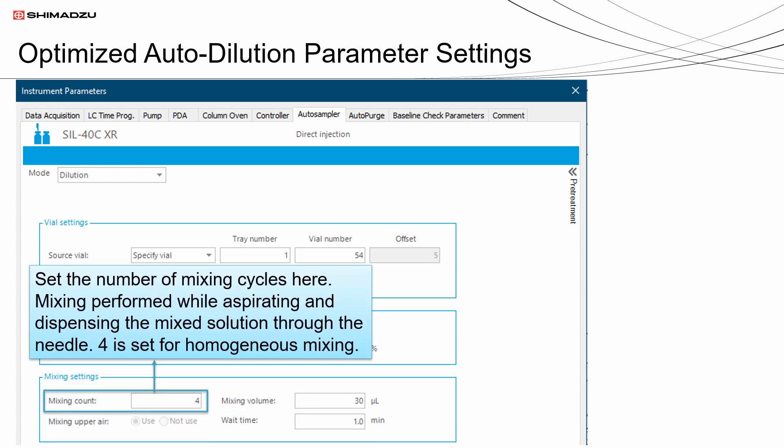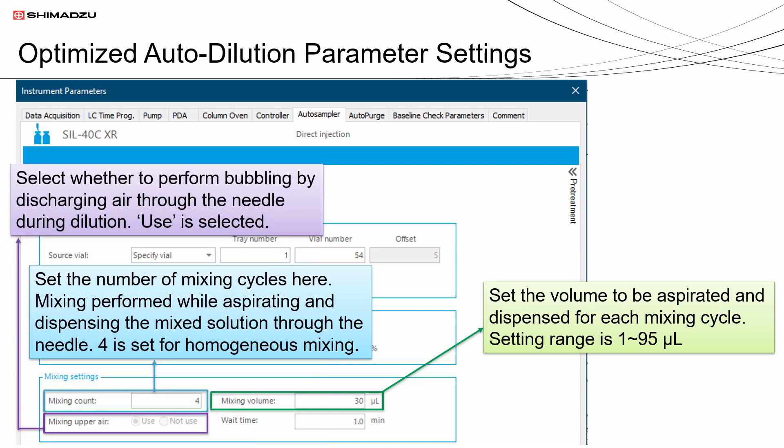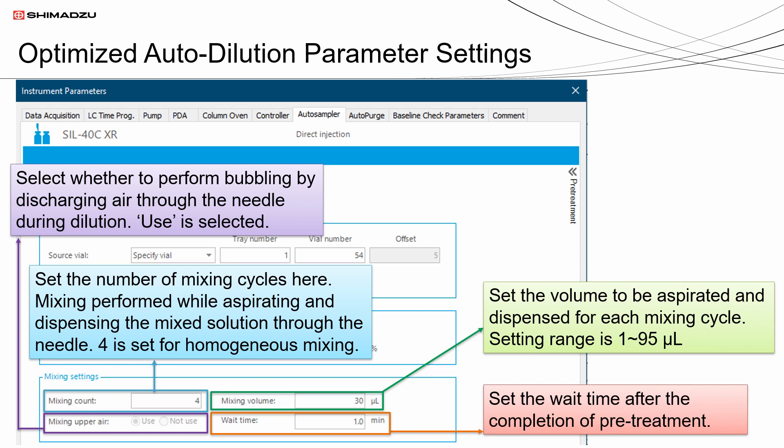Set the number of mixing cycles. Here, mixing is performed while aspirating and dispensing the mixed solution through the needle. Four is set for homogeneous mixing. Set the volume to be aspirated and dispensed for each mixing cycle. Setting range is 1 to 95 microliters. Select whether to perform bubbling by discharging air through the needle during dilution. Set the wait time after the completion of pre-treatment.